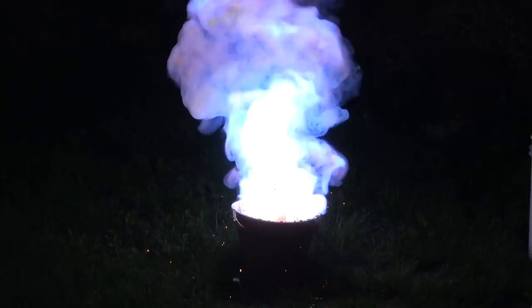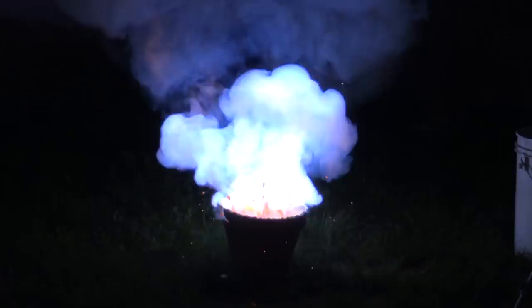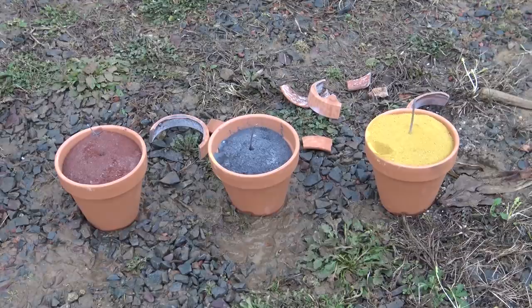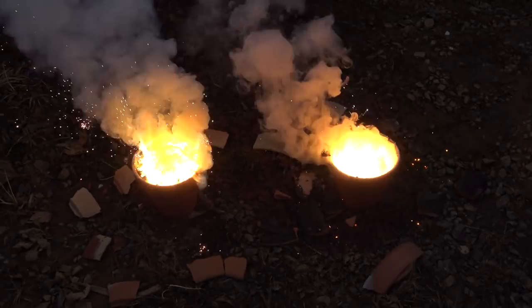For this series, I wanted to do the reactions in a sort of increasing difficulty. So for this first video, I'll start with the basics. In terms of the reactions, I'll be showing a comparison between regular thermite and one that uses flux, a comparison between three types of commonly available iron oxide, a final larger batch of both the red and the black iron oxide, a chromium extraction, and finally an attempt to make type 304 stainless steel alloy. We'll see how that goes.